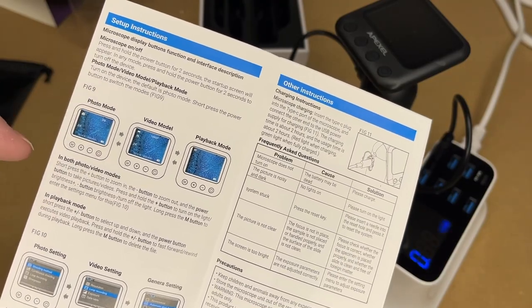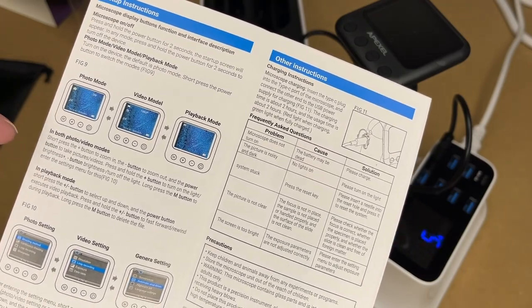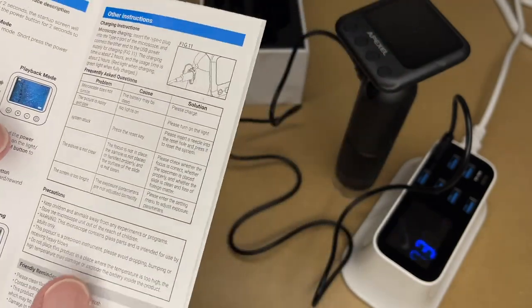It has photo mode, video mode, or playback mode. Short press the plus and minus to zoom in and out, and press the power button to take pictures. Hold down the plus or minus to adjust the brightness. Long press M to go to the settings menu. Then we have the playback mode instructions and the different settings.